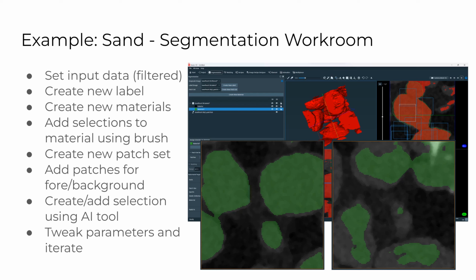It depends on what you're imaging, what your imaging device captures. Ultimately, you're dealing with numbers, from 0 to 255 or whatever it is.